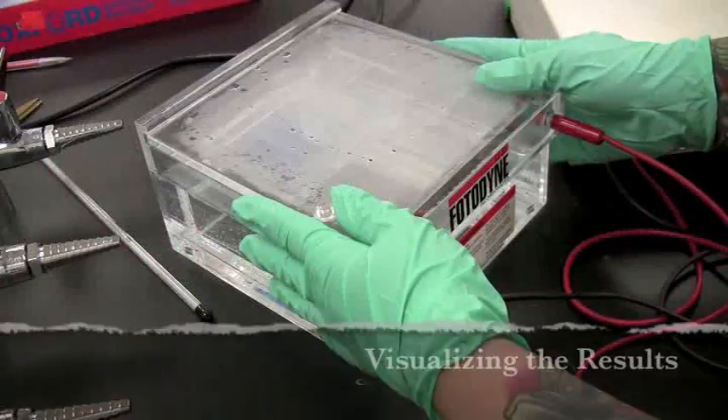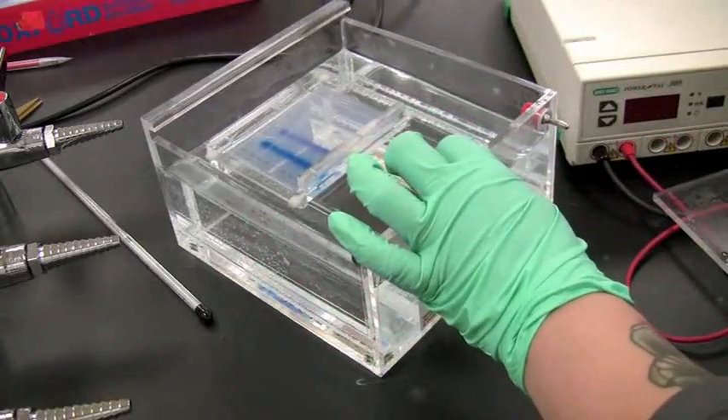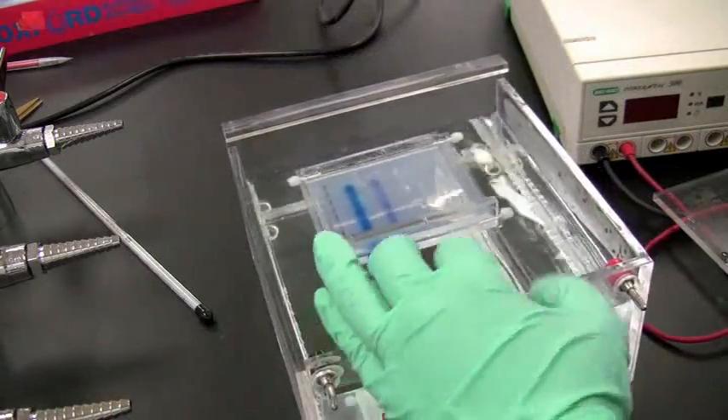After the run is done, turn off all power and remove the chamber lid. Remove the gel and place it into a staining tray. Cover the gel with stain and leave it overnight.